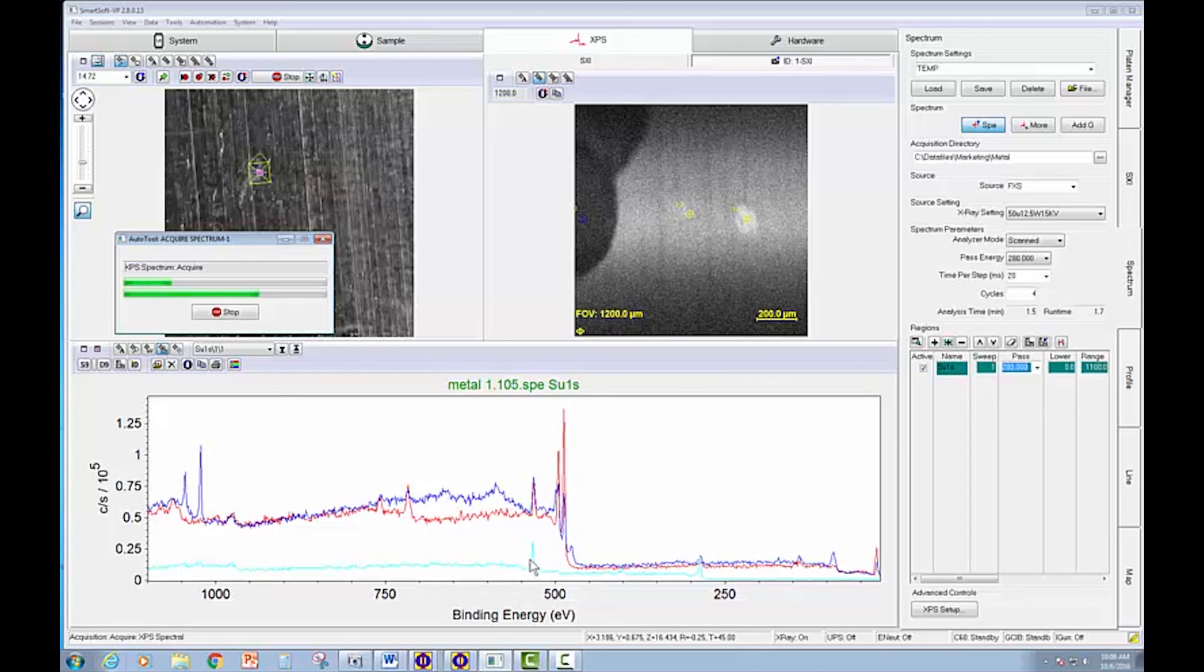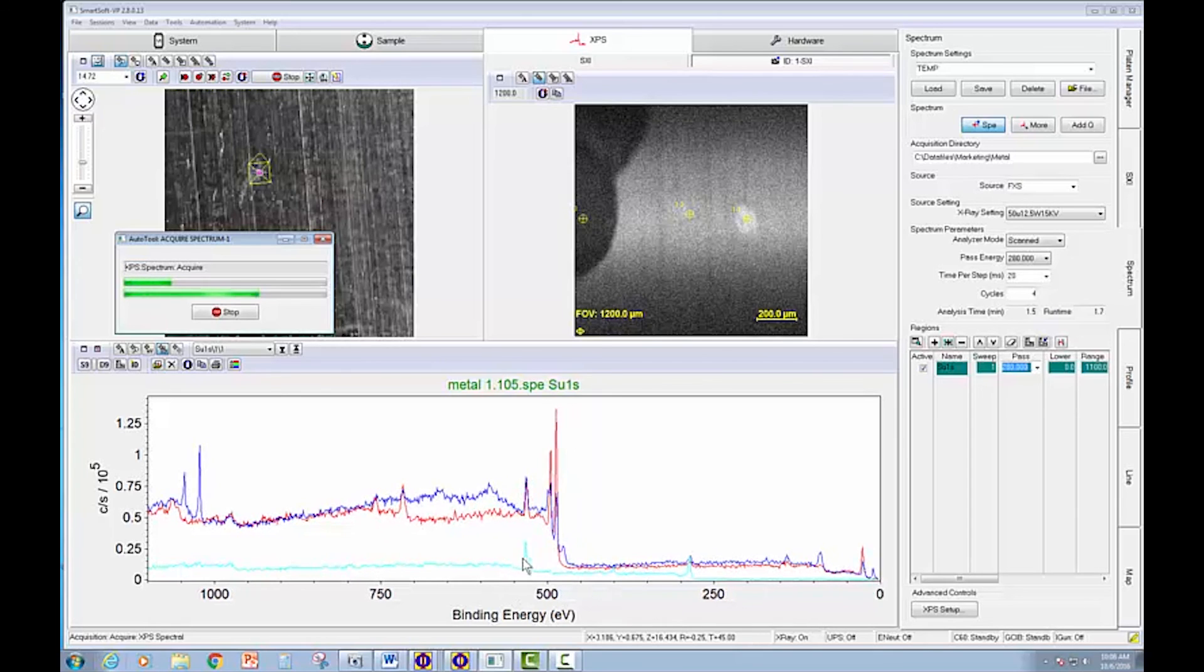Looks like we're seeing an organic. We're seeing oxygen, nitrogen, and carbon in this dark area.